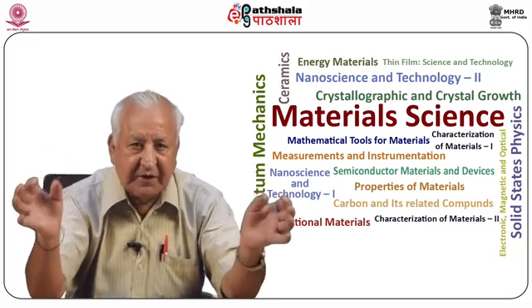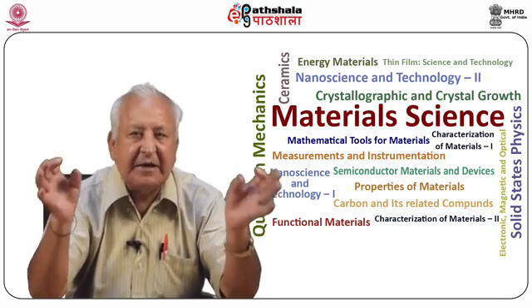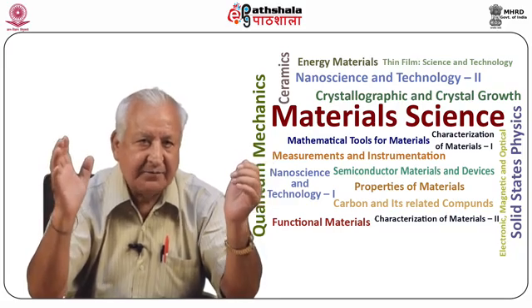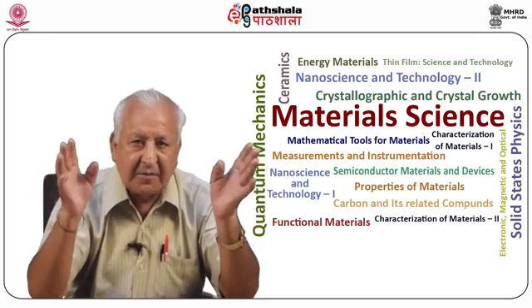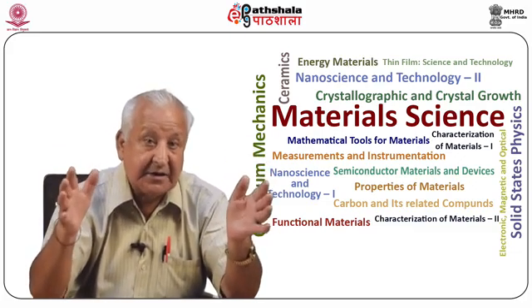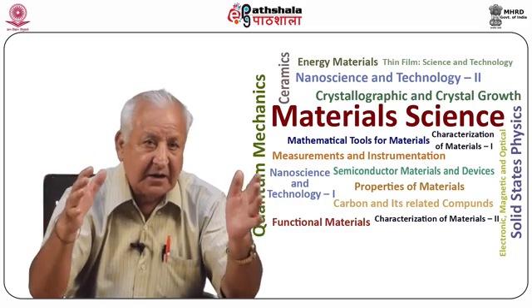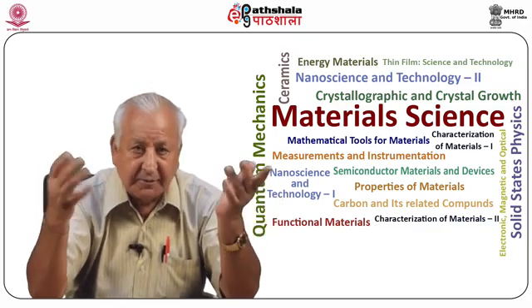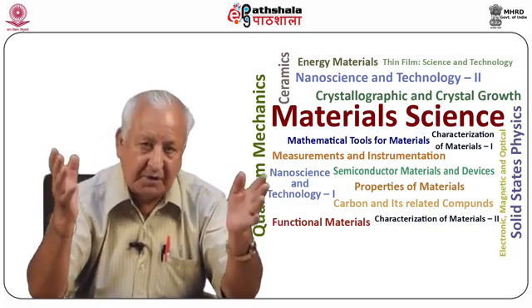The sample is obviously in a polycrystalline form, which is an aggregate of extremely tiny crystallites randomly oriented with respect to a given direction, and as such, all possible orientations of all lattice planes are present in the powdered sample. There is bound to be a certain number of crystal grains which will be positioned with a given set of lattice planes making the correct angle with the incident beam for reflection to occur, while another fraction of the grains will have another set of planes in the correct position for reflection, and so on.